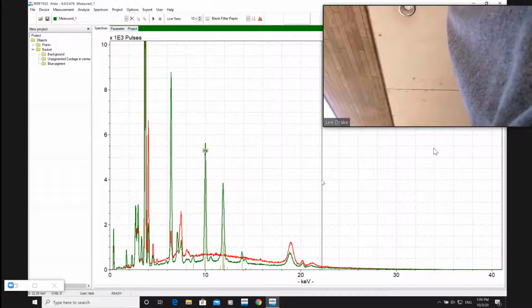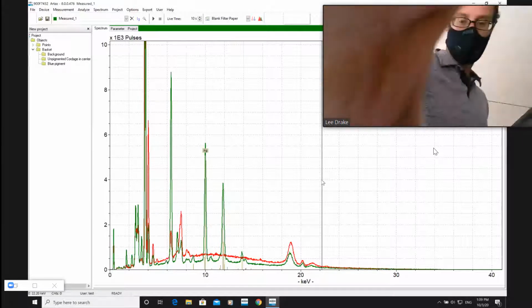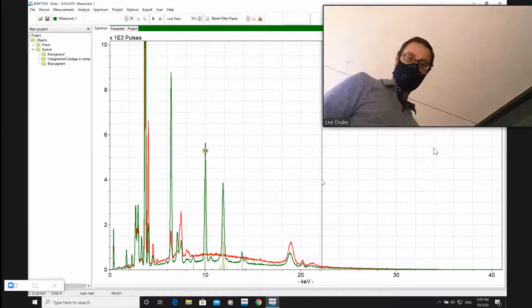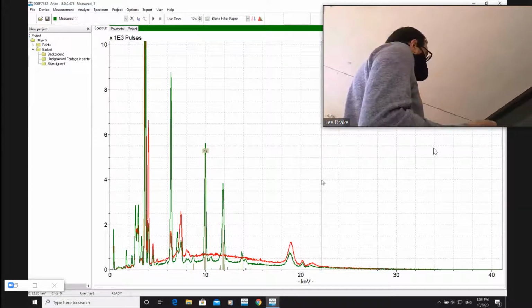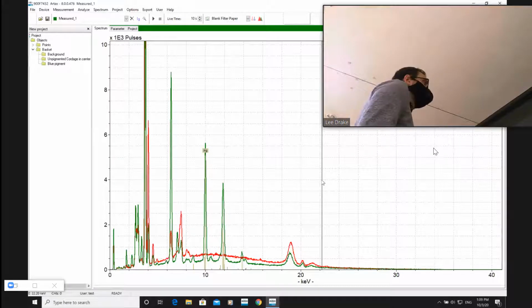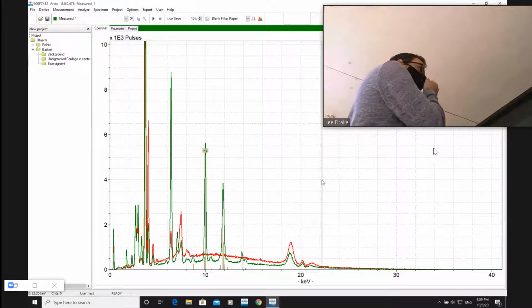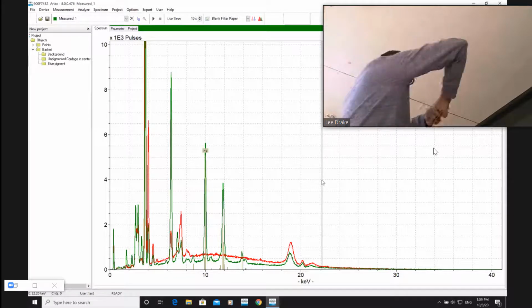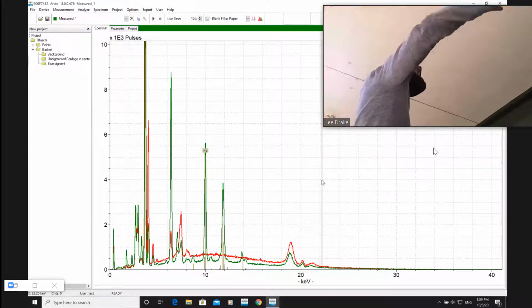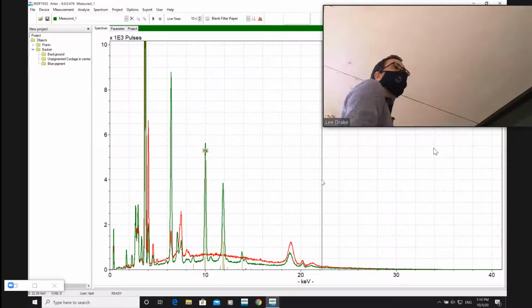If you wanted to quantify the danger this object was in, what you would want to do, so I should point the camera, this is not very compelling TV, but if you wanted to preserve this object for the long term, you'd want to use a technique called microfading. Have you guys heard of this? Visible light is more damaging to this than the XRF. The XRF is ionizing the internal electrons of the mercury. This is analyzing the sulfur-mercury bond itself, right? So every time it's fluorescing in light, it's being damaged at the same time. It's being bombarded by all these photons. Its electrons are moving around.